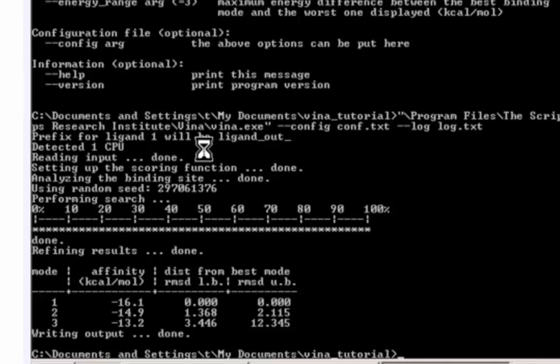Those of you familiar with AutoDock may have noticed that Vina does not require you to pre-calculate the grid map files or to determine the atom types in the grid maps. It calculates its grid maps automatically after it starts, and because it does it rather quickly, there is no need to save or read them from files.